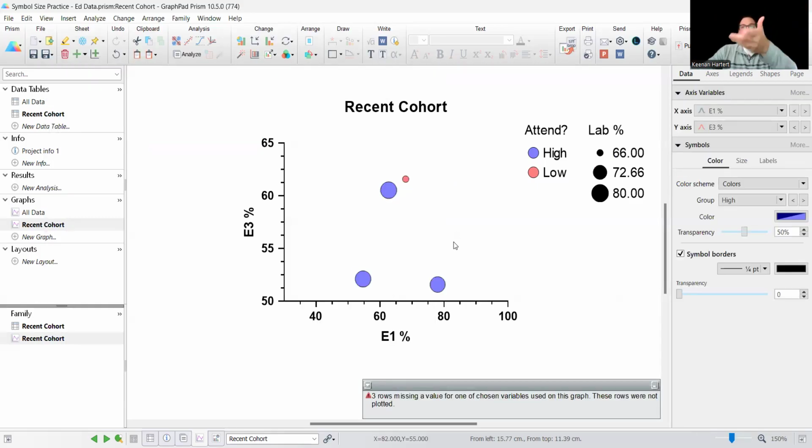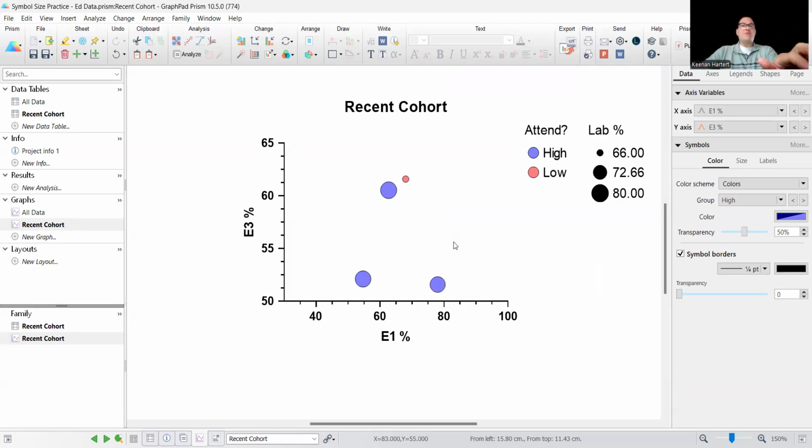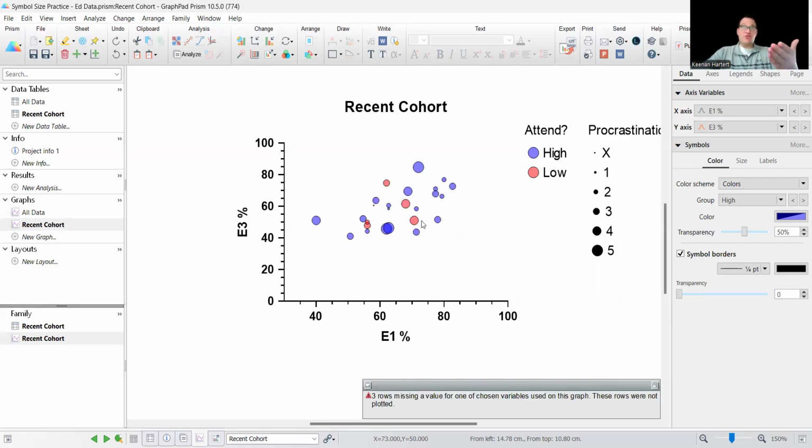In that case, I did a blatant example there to show people that still had lower than 80% lab scores. So you do have some capabilities in terms of customizing who's allowed on the plot. If you get someone that is just a massive number, it could blow up the scale. So that tool I just showed you is a way to customize and say, hey, if you're too big or too small on the other end, you can get omitted or just called the max size or the smallest size. So you don't get one giant bubble amongst a bunch of tiny ones.